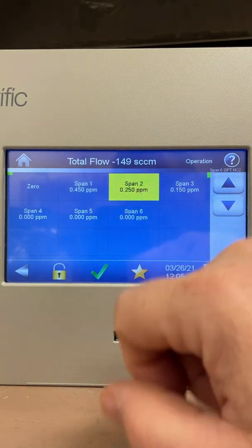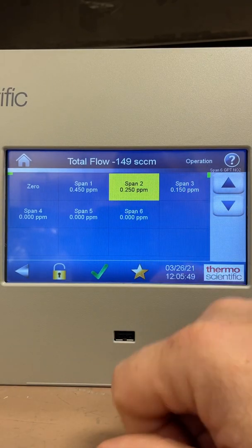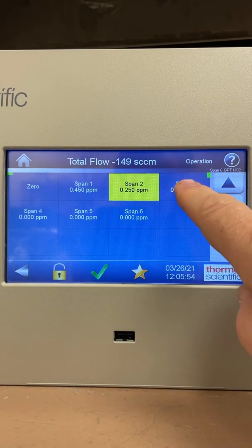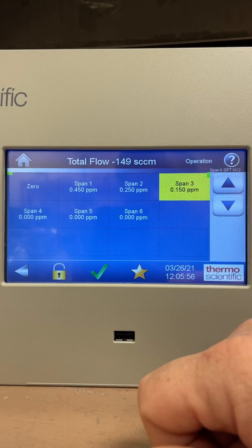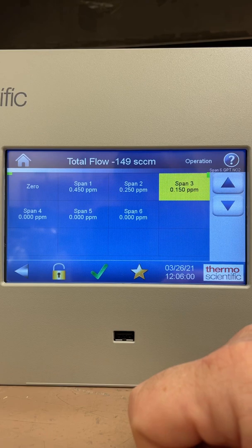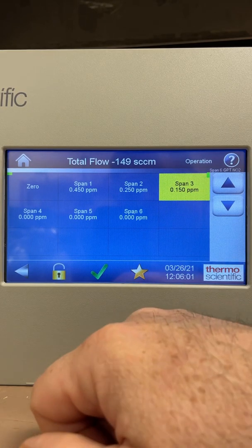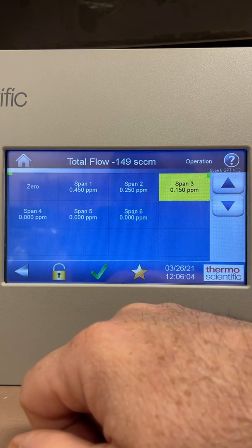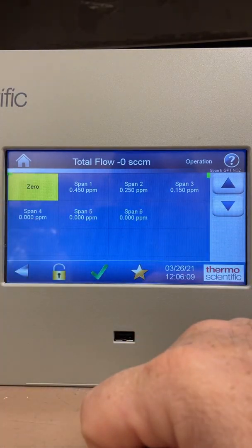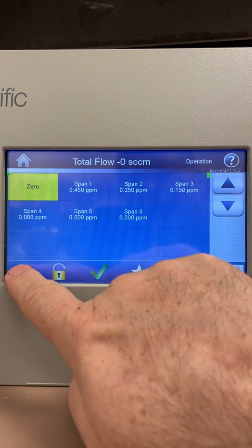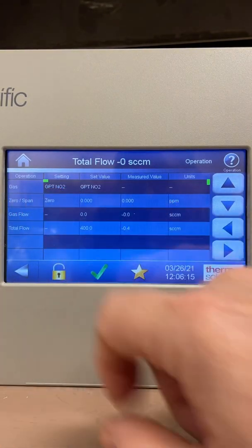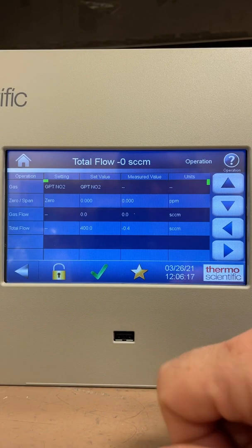I'll hit span 2, go down to my next point at 0.250 ppm, and after that on to span 3 at 150 ppb. That's the GPT function of this instrument. When I'm finished, I press zero and it closes both valves. I can go back to the main screen and see I'm still sitting in GPT NO2 — that's how simple it is to operate.